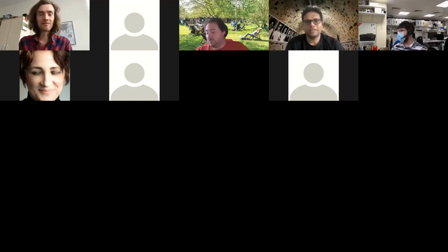Yeah, excellent answer. And I especially like the psychological part, that people think unless it costs $1 million, it won't give me a good image. And whatever the $1 million instrument throws up, people just blindly believe it's a great image without even going for some more validation. So I think it's a very important point, and also the mindset the science community has gone into.